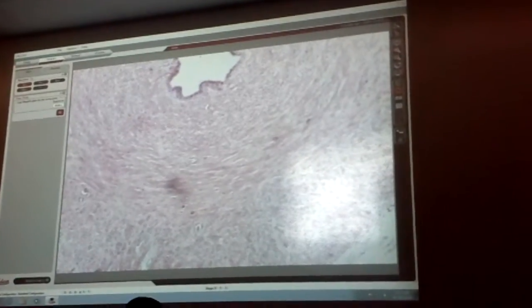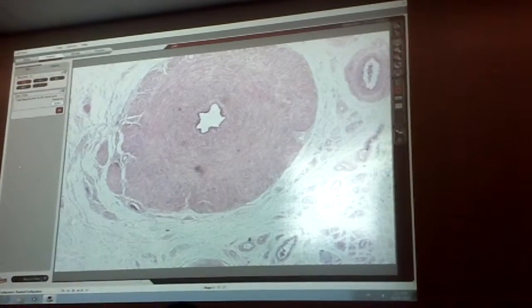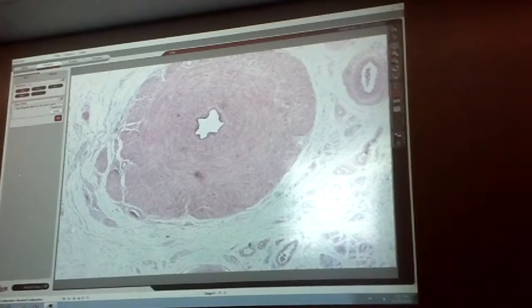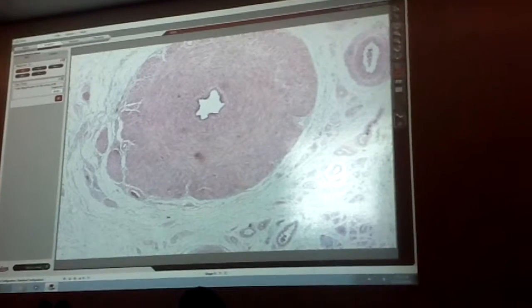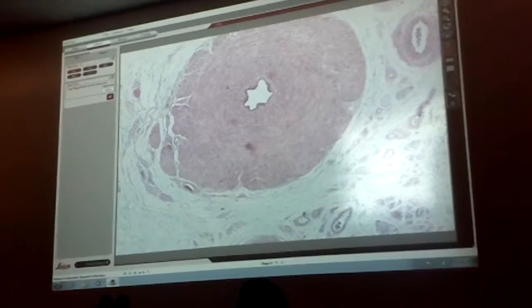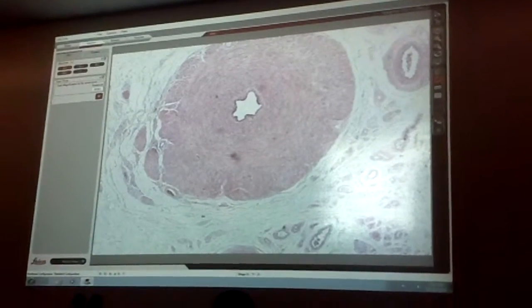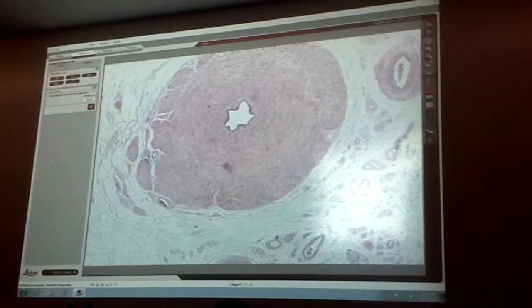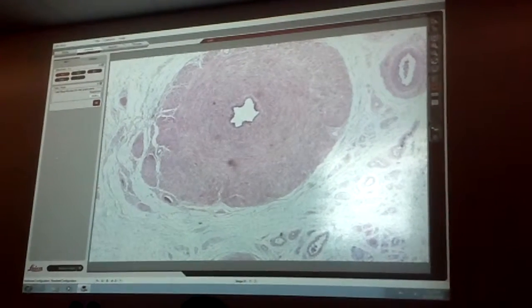Let me go on the lower power. If you see this, again, don't choose an artery or something. It's not an artery. On an artery, you're not going to have a distinct cellular layer lining the lumen. So PSCCE, longitudinal, circular, longitudinal, vas deferens.